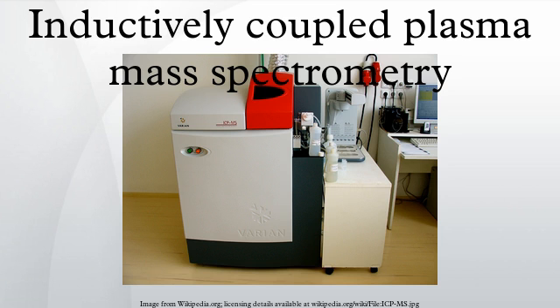In the field of flow cytometry, a new technique uses ICP-MS to replace the traditional fluorochromes. Briefly, instead of labeling antibodies with fluorochromes, each antibody is labeled with a distinct combination of lanthanides. When the sample of interest is analyzed by ICP-MS in a specialized flow cytometer, each antibody can be identified and quantitated by virtue of a distinct ICP footprint.